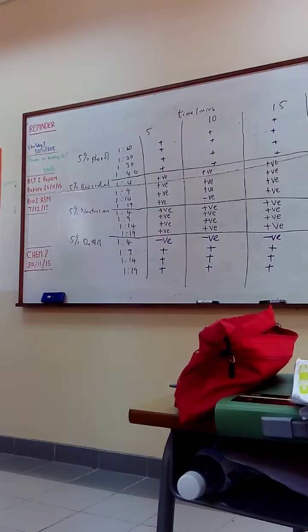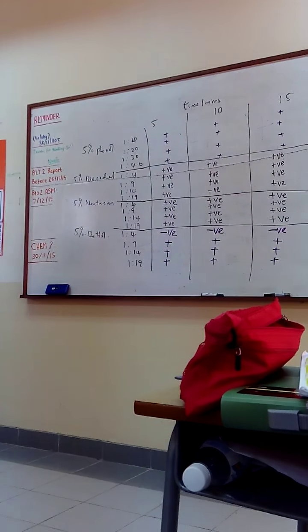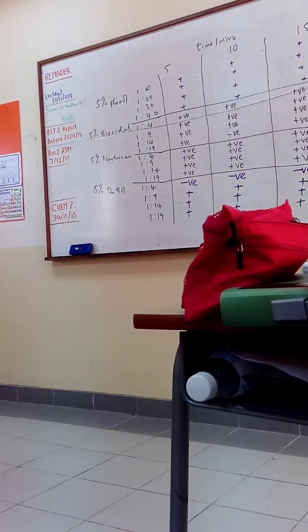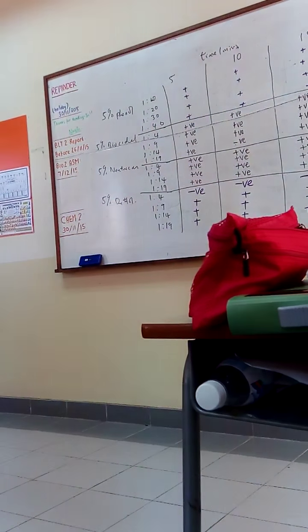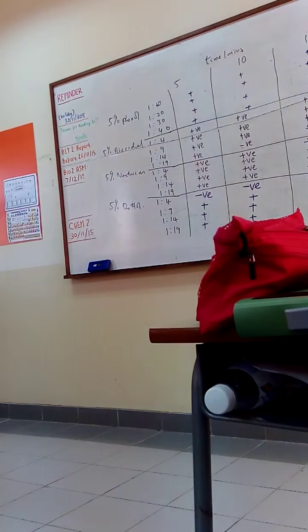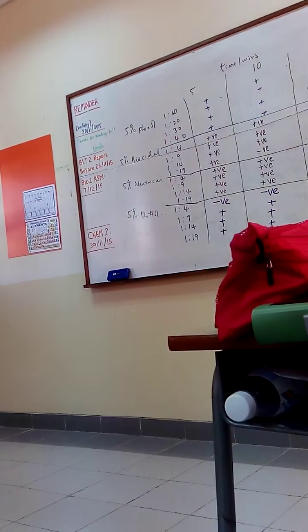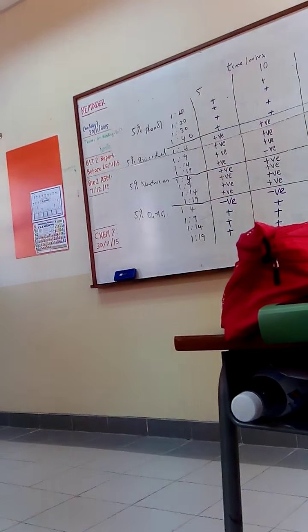Different dilution. What do you mean by effective? The effective one is negative or positive disinfectant. If negative, it means no growth, that is the effective one. Yes. But for the phenol there is no negative, isn't it? Yes. So we have to consider the lowest one, which is 4. Am I right? For phenol, sorry, 10. There is no dilution that has negative for phenol. So I have to consider 4 as the lowest, isn't it?